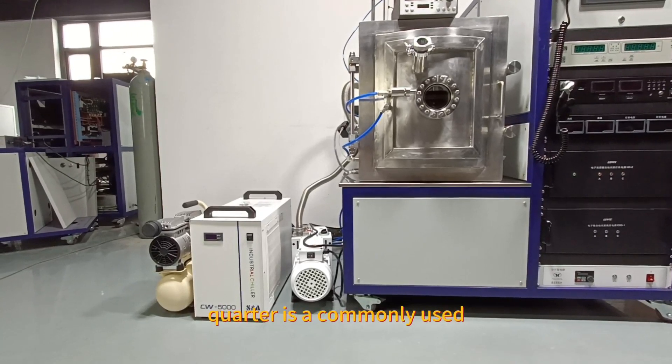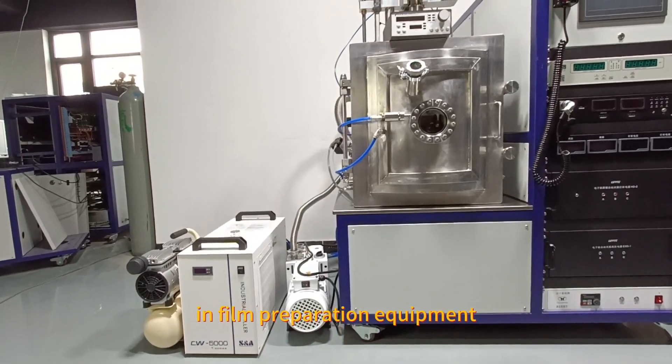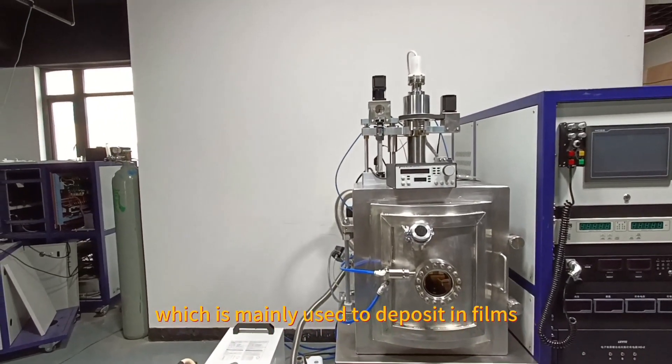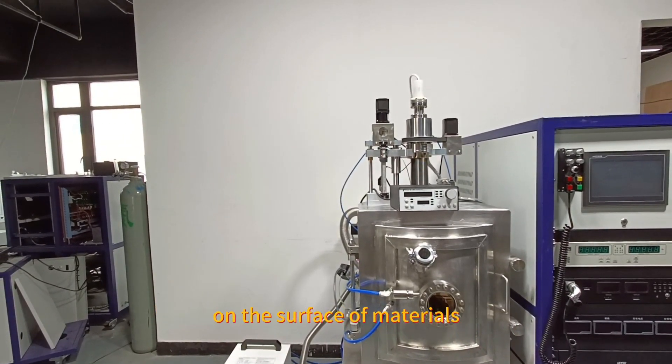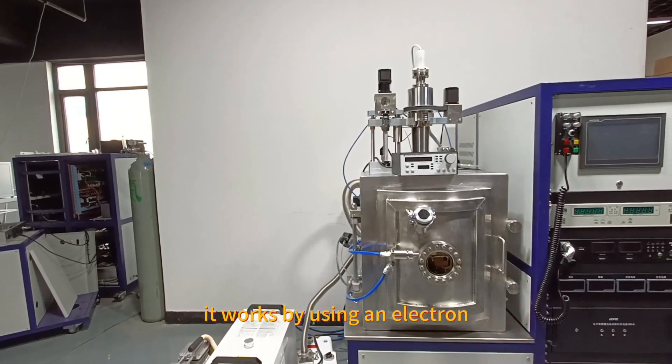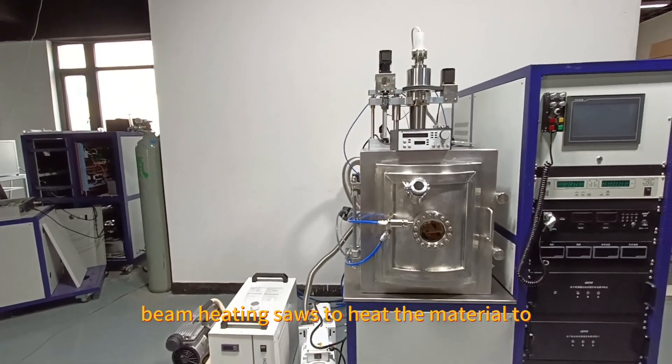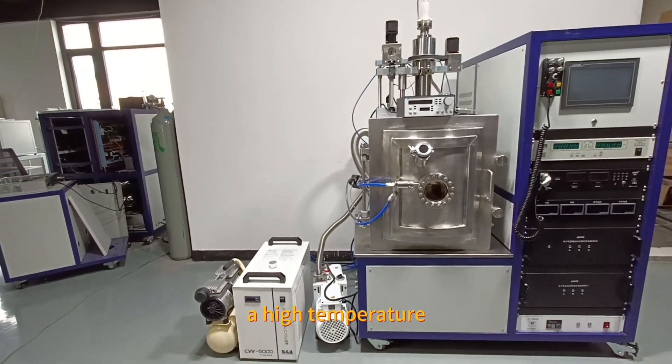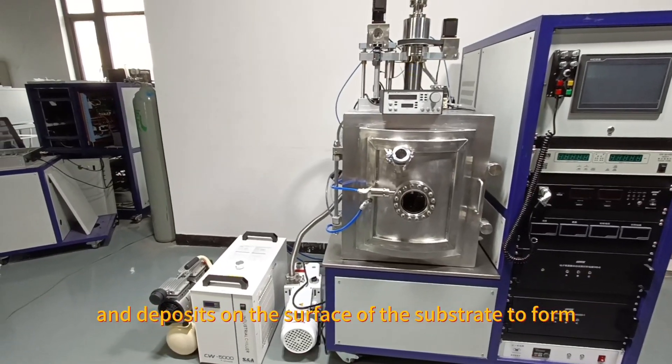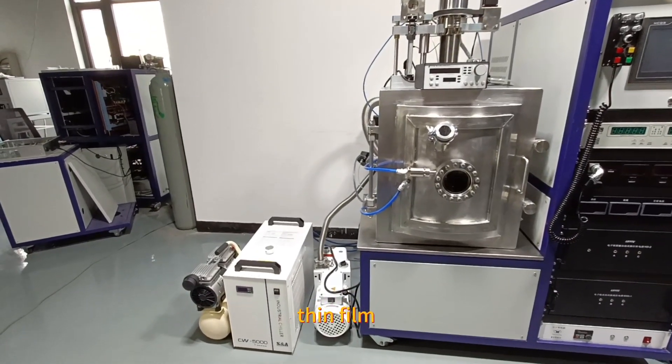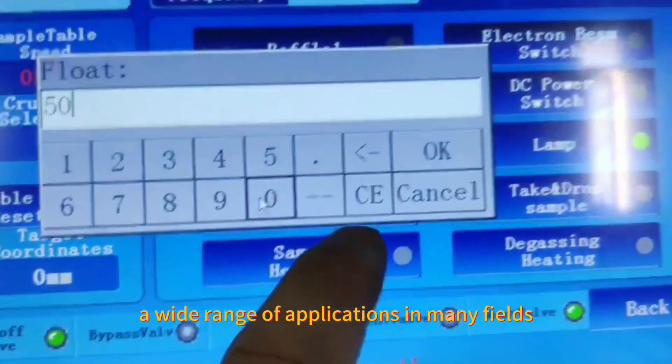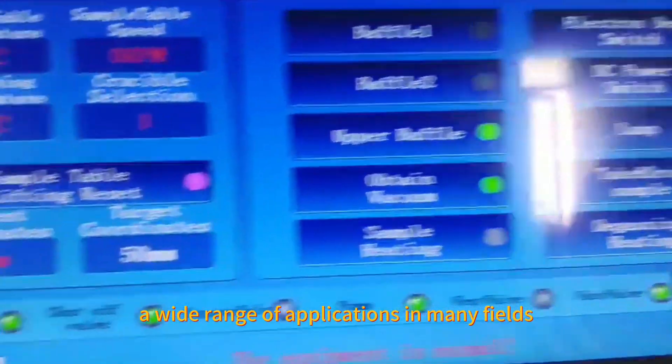Electron beam evaporation coater is a commonly used thin film preparation equipment, which is mainly used to deposit thin films on the surface of materials. It works by using an electron beam heating source to heat the material to a high temperature so that it evaporates and deposits on the surface of the substrate to form a thin film. Electron beam evaporation coating instruments have a wide range of applications in many fields.